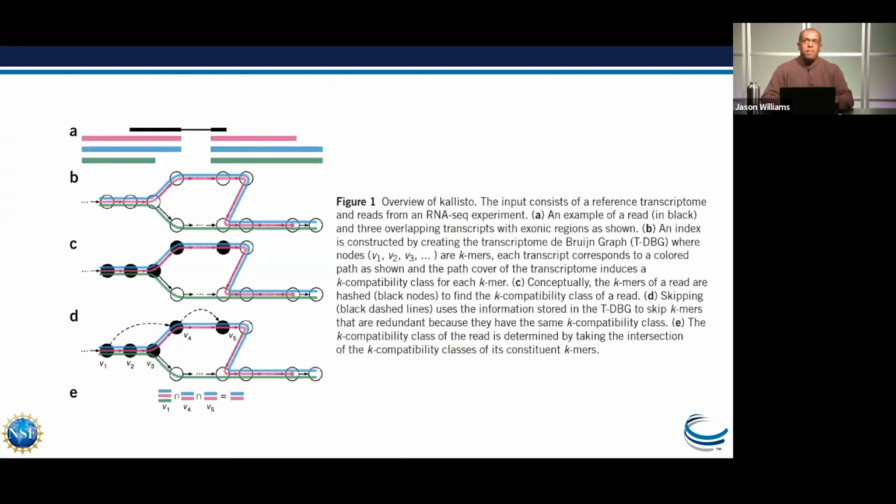Traditionally, when we have done RNA-Seq and we did alignment, the way that the software developed was much in the same way that software for genome alignment worked. In other words, there was a matching of nucleotide to nucleotide, and all of those, let's say if you had 150 base pairs in a read, you really want to match carefully each one of those 150 base pairs. But actually, in order to do an RNA-Seq experiment and to do those quantifications, you don't need all of that information. You really just want to know whether that read came from a transcript or did not come from the transcript, and make a count thereabout.